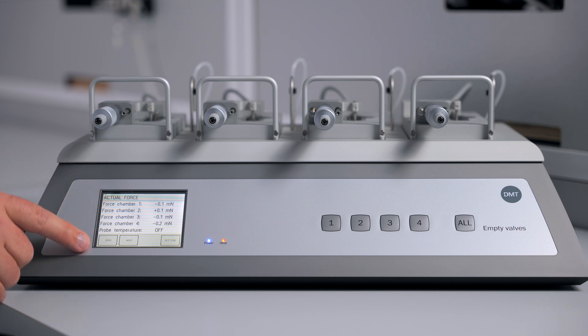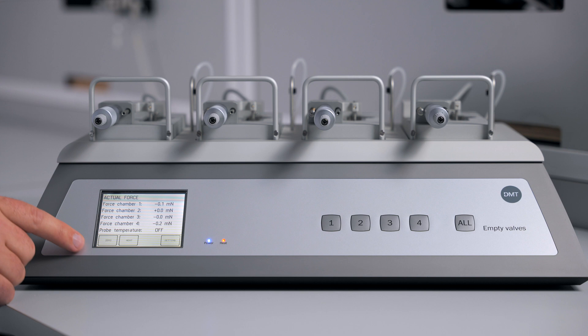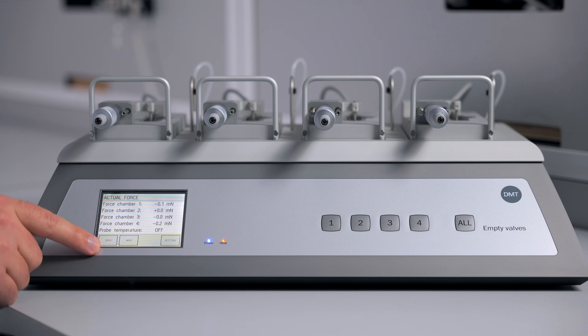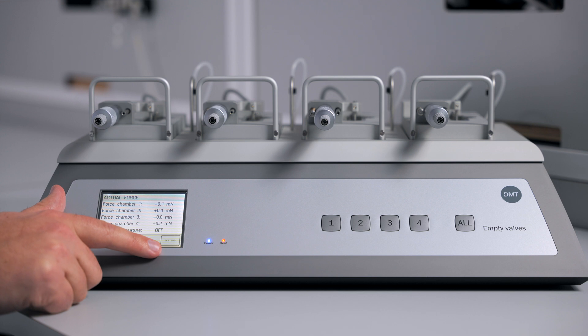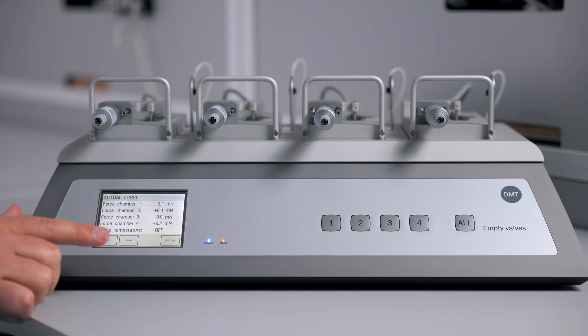The touch screen on the interface will allow you to see the forces in your chambers. You can also zero these forces, turn on heat, perform a force calibration, or take a pH reading if the probe is equipped, as well as other functions. The screen is liquid resistant, although you should wipe up any spill as soon as you can, and make sure to only use your fingers and not pens or lab tools.